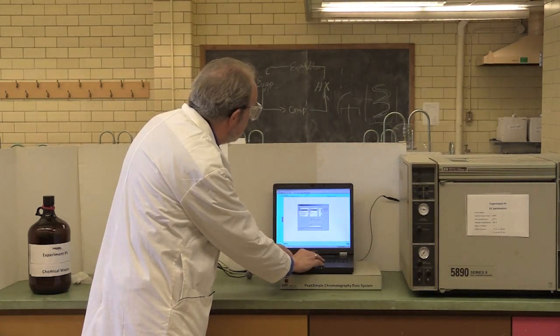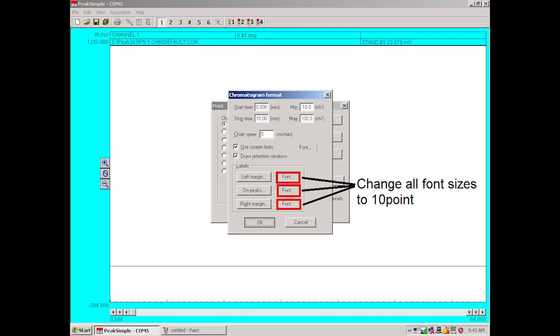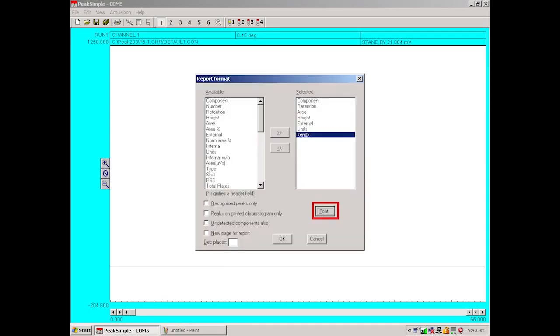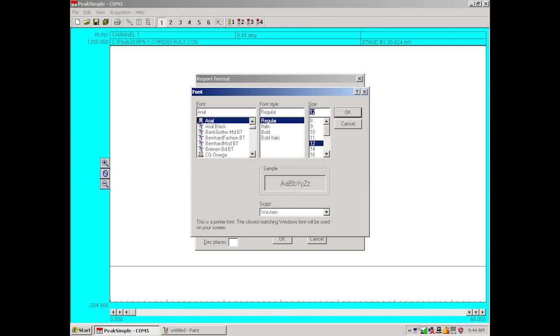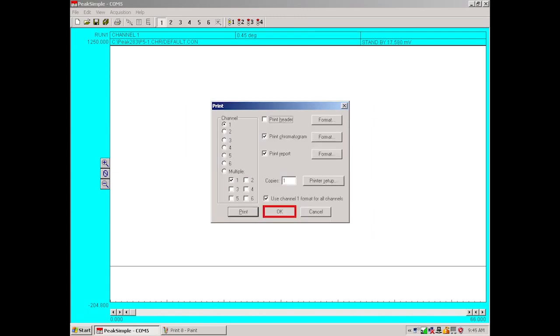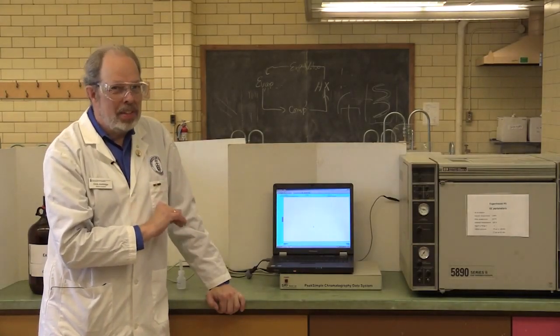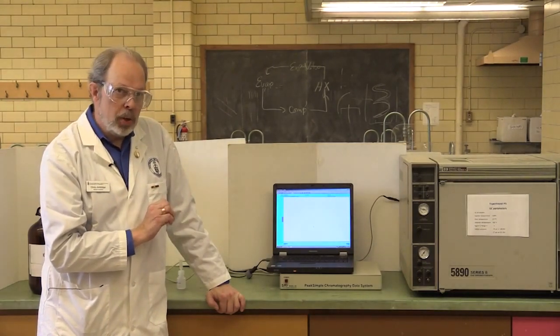Then you're back here. Again, left margin, font, ten point, okay. On peaks, font, ten point, okay. And likewise, right margin, font, ten points, okay. Then we click okay for that one and we're now down to print report. Click on format there. And again, we need to click on font and take it to ten point, okay. And then okay again. And you have okay. You have now reset the print defaults and everything will work and give you a decent looking print by the time you want to actually print it out.